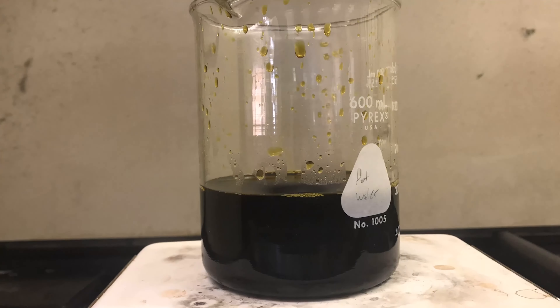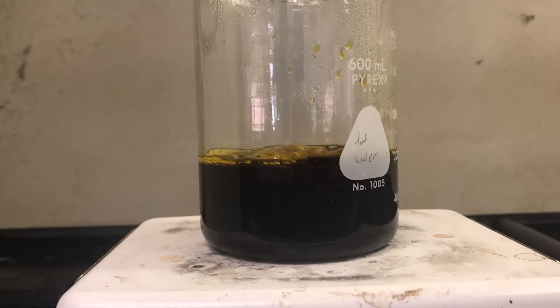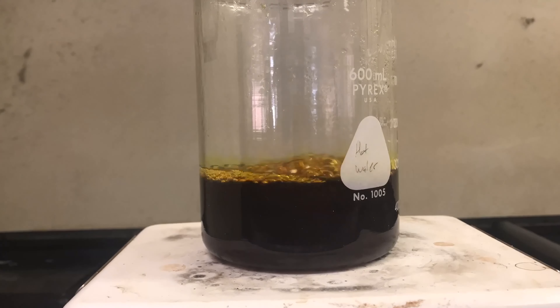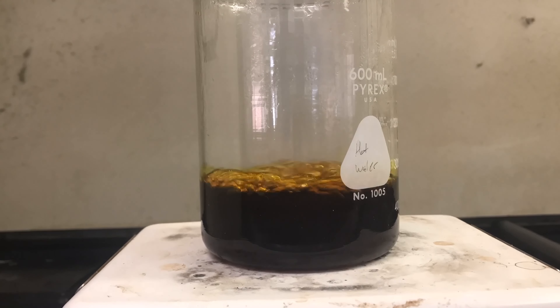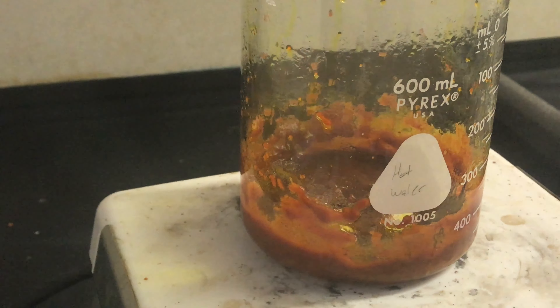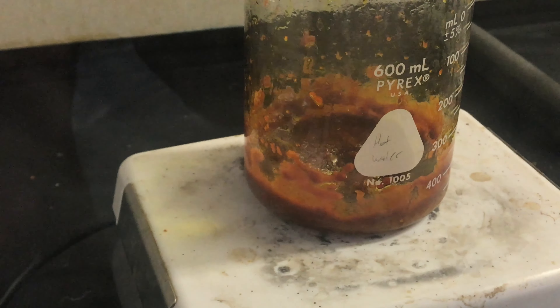I just filtered it through cotton and then boiled the water off. I suspected this process would also be releasing some chlorine gas and hydrochloric acid, so I did it in the fume hood. I pretty much cranked up the hot plate as high as it would go. Once it got down to a low level, the material started splattering around and leaping up out of the liquid into the surroundings — which was fun to clean up later.